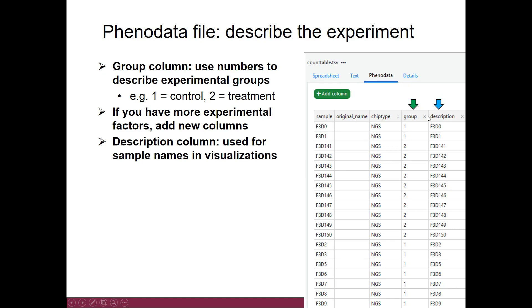The description column has a special function — the text here is used for sample names in visualizations. So you can control what is shown in visualizations by writing the names here.